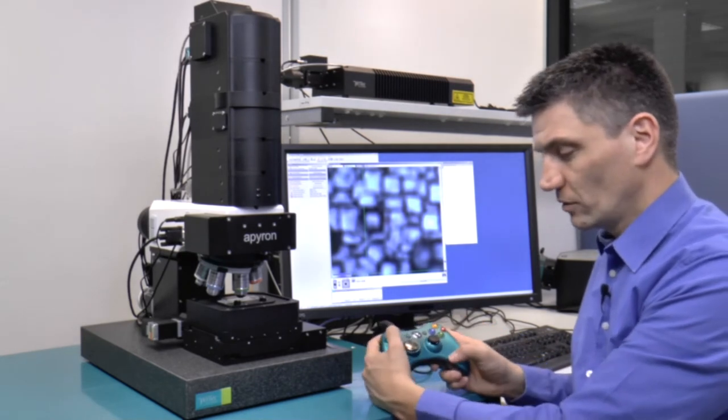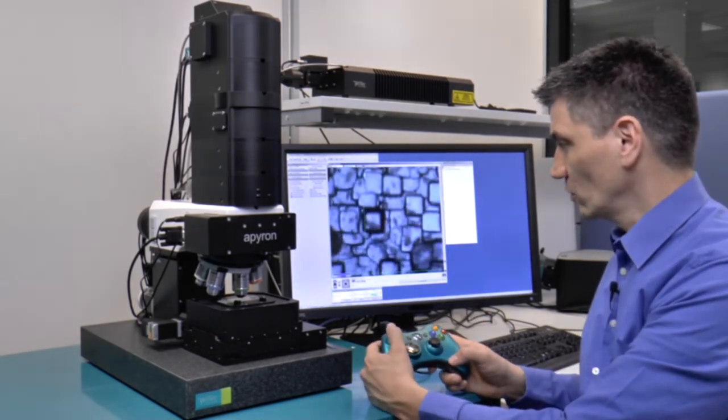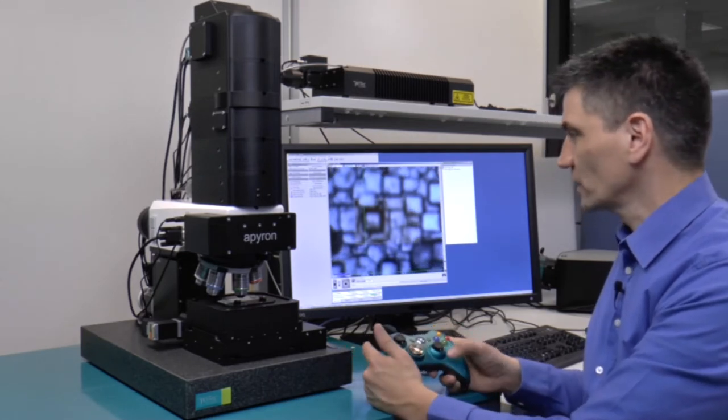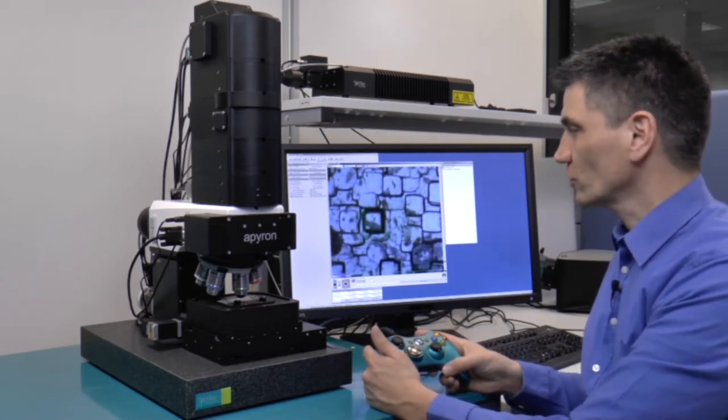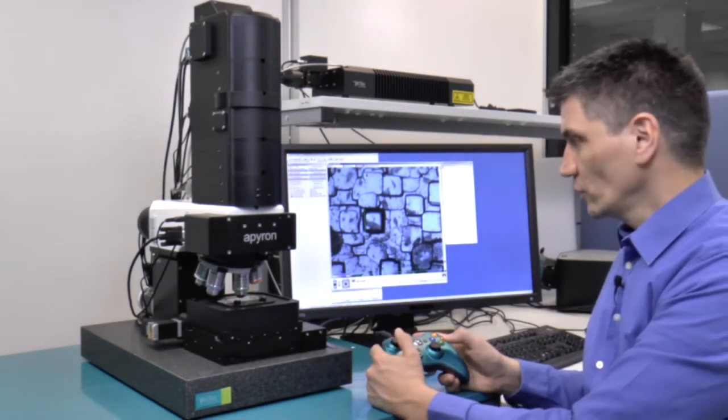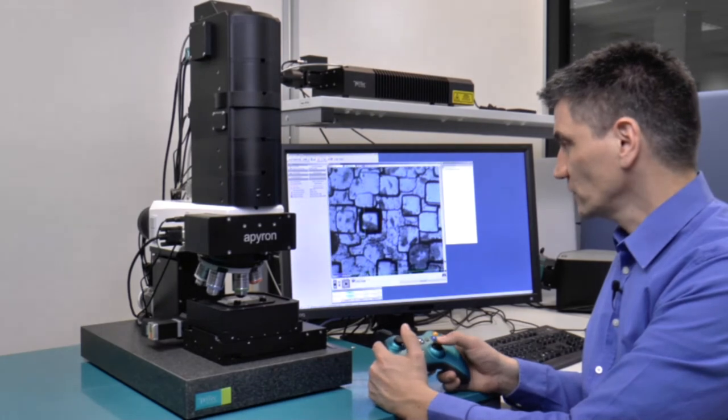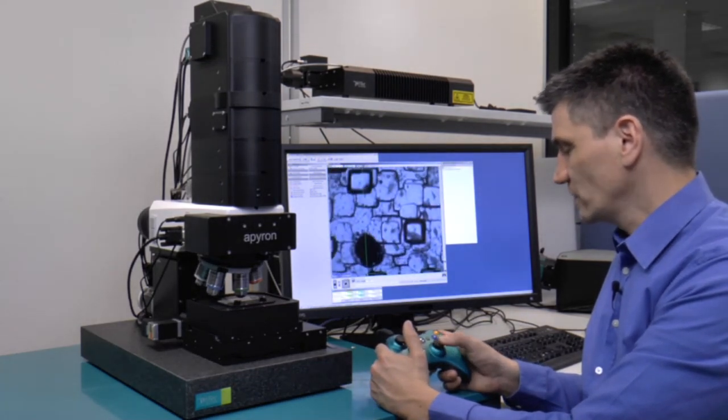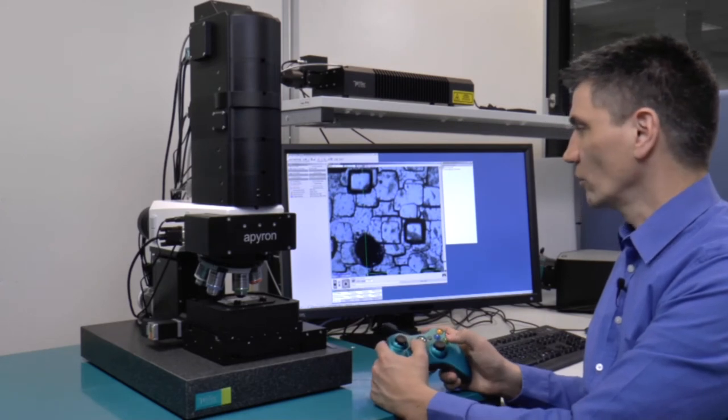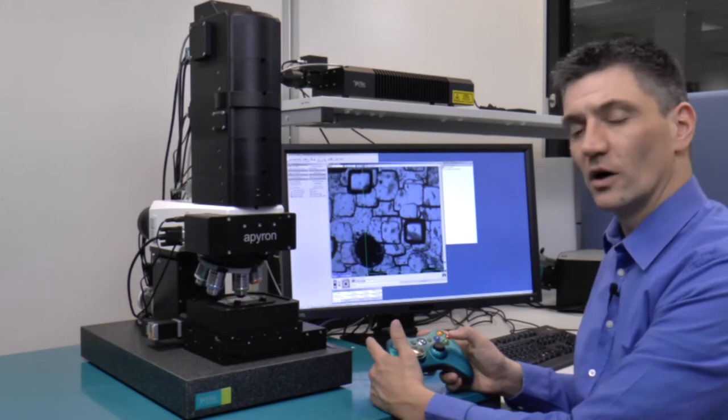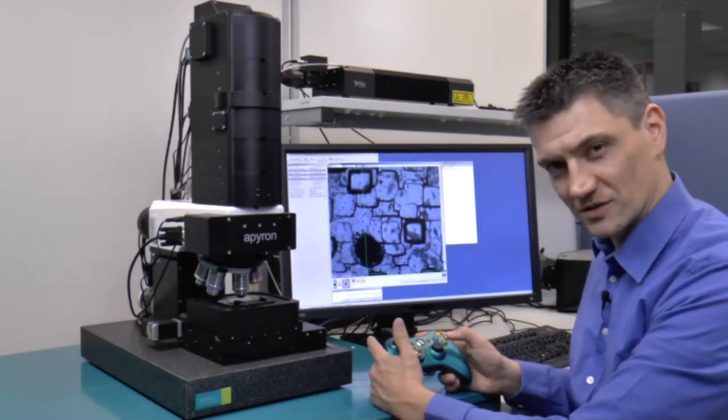You can, for example, focus onto your sample with the focusing part, or when you're almost in focus, hit the auto focusing, which does an automatic focusing based on the contrast. You can then move around your sample and find the area of interest. Once you have it, you've got control over the illumination, or you can do an automatic illumination so the illumination is automatically adjusted for you.